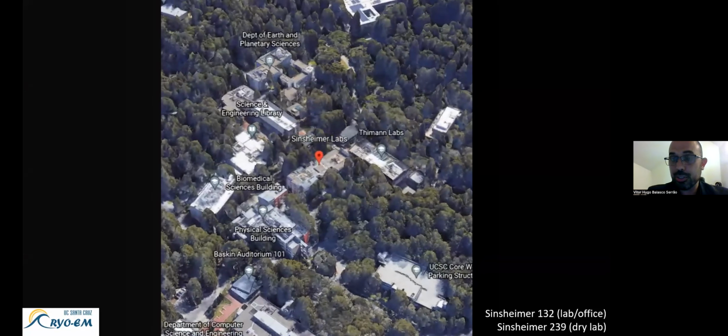And we have two different workflows. One is you provide your sample and you don't want to learn at any point, and I am responsible for doing all the sample preparation, screening, getting access to the high-end instrumentation, and then we go from there for the further data processing later on once we have the massive amount of data. But we also train users, so local users are getting trained on data processing, and sample preparation is also part of our services.